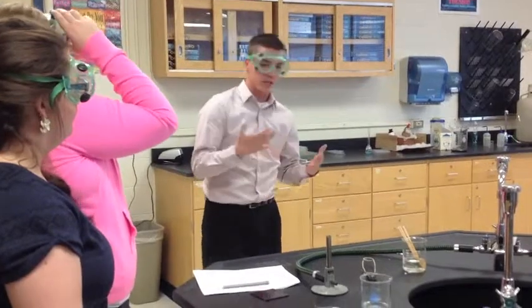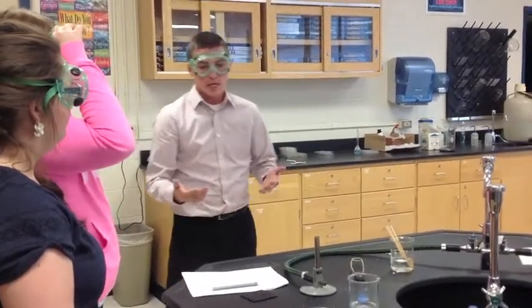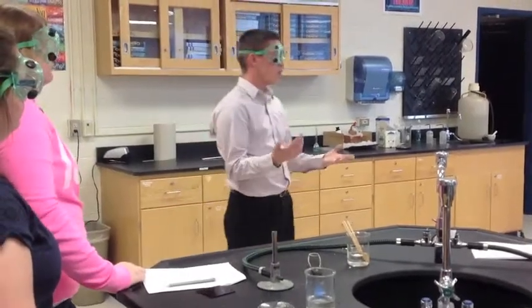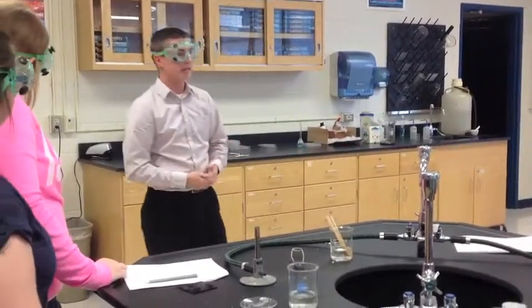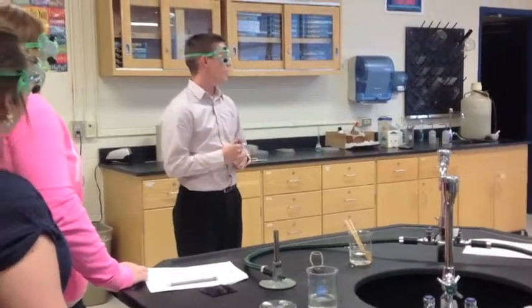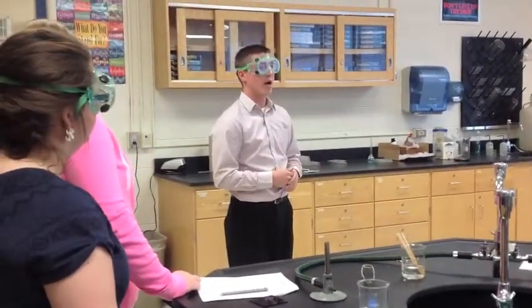Instead of us just telling you that the copper gives off a greenish-blue color, we're going to let you actually experiment with it and see it for yourself. It'll be a good learning experience for you. It's something that gets you interested, so I think it'll go well.